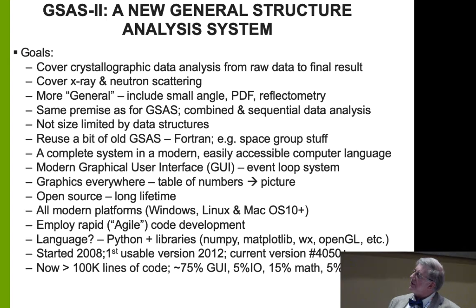And basically, it also now allows one to do combined analysis like the old GSAS, but also sequential analysis, where you do the same calculation over a whole series of data sets. And this was not to be limited by the sizes of data structures. Basically, there's no limits on the numbers of patterns and phases and whatnot. I used a bit of the old code, and it was needed to be in a modern, easily accessible computer language. No exotic things. And had to have a modern graphical interface.